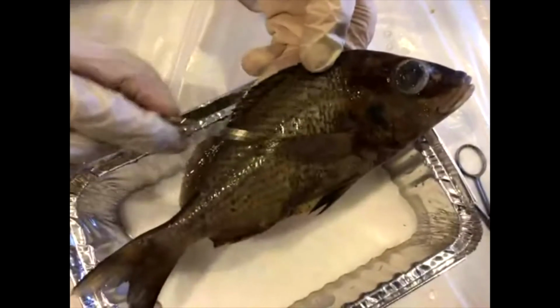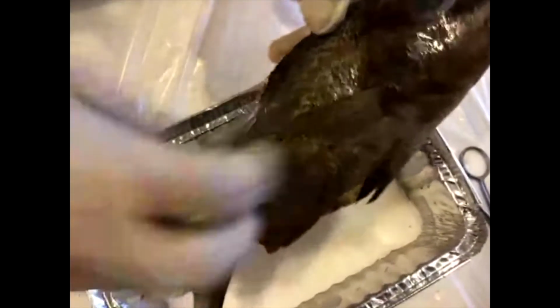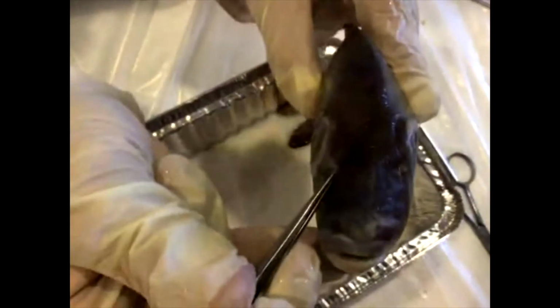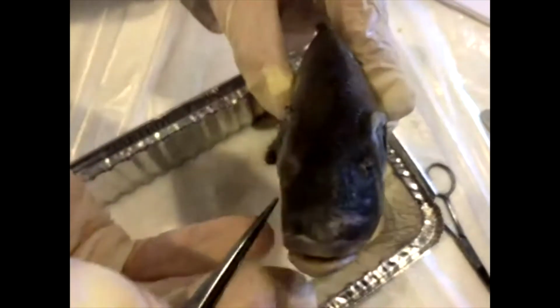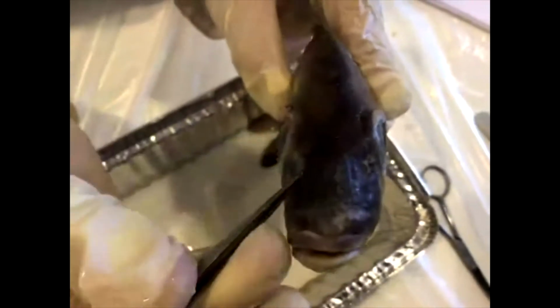So this is actually kind of like a sensory structure along here. And I'm realizing now that I forgot, but if we look really closely on the top, the fish does have two nostrils here. And they do work kind of similar to humans' nostrils, but rather than scents or chemicals being mixed in the air that we detect, this fish would actually detect chemicals through water from here, and these connect to its brain.